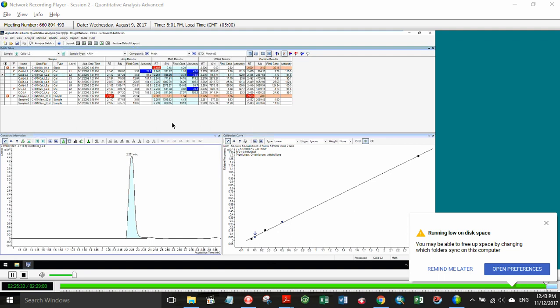They become noise ions. They're constant throughout the entire TIC. When we do that dynamic background subtraction, all that we're doing is subtracting that out in the sample information window or the TIC window. That's all that's doing.